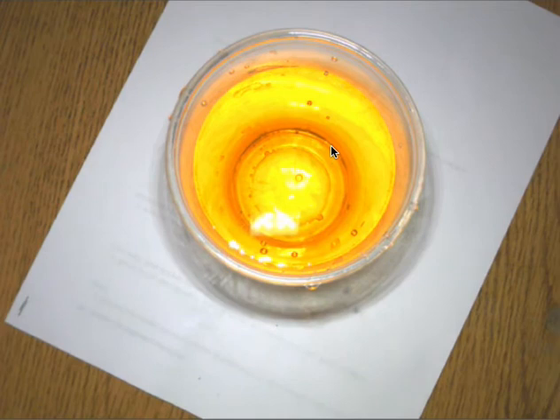So what does that tell you about where the glucose was originally? And now where is it? So did it diffuse? What does it tell you about the size of the glucose? Just remember that this dialysis tubing is semi-permeable. Is starch present in the cup? Well, we have iodine in the cup. What do we know about iodine and starch when they combine? And of course, we know that iodine's in the cup because it's yellow.